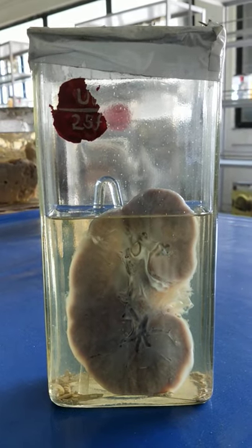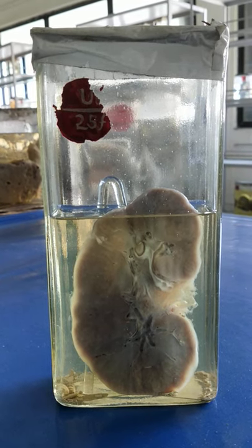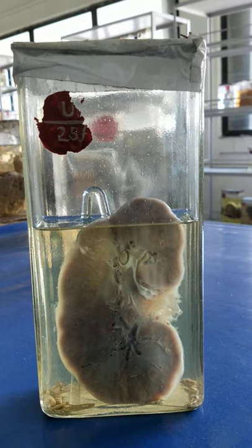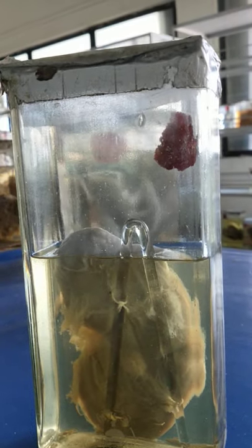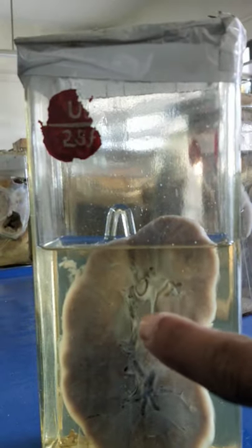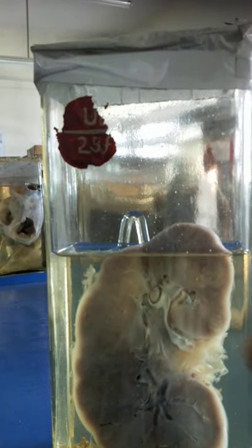This is the second specimen — a wet mount specimen of one half of a kidney. It is grossly enlarged, its outer surface is smooth and grayish white in color. The cut surface is smooth and glistening white in color.